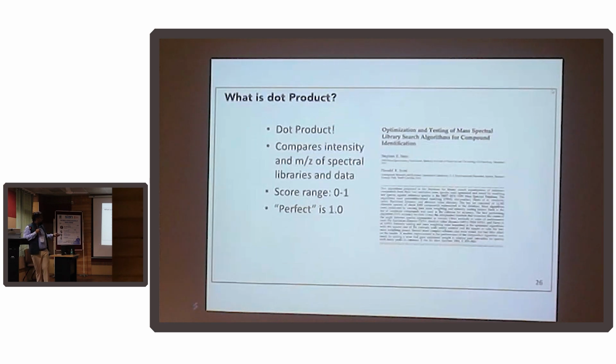The range is from 0 to 1, and just like correlation, anything less than 0.8 is fishy, and anything less than 0.5 is extremely doubtful. But a lot will depend on you as an experimenter, on what you set up as the baseline. If you're trying to detect something, maybe in animal biology, you can go for some lower limits.